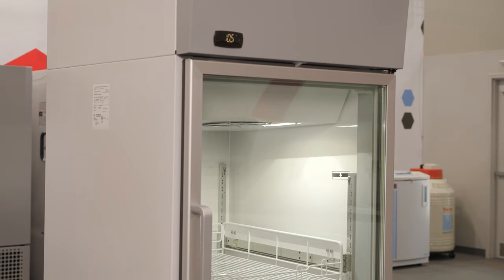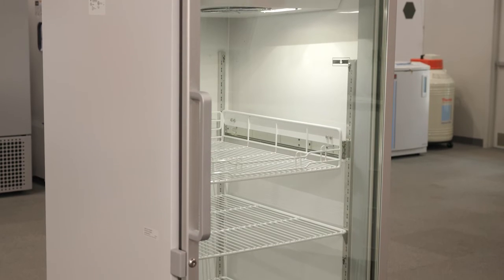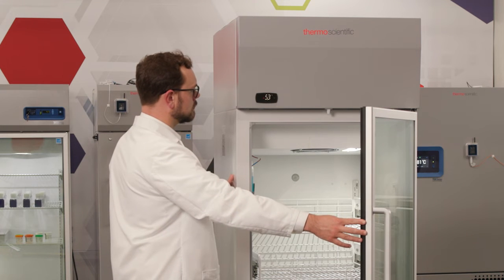Let the empty unit operate for 24 hours, or a minimum of 12 hours, to reach the proper temperature and stabilize. For critical applications, verify that the alarm systems are actively working before you load any product.